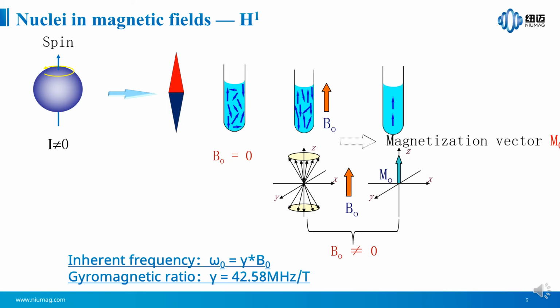The magnetic resonance device, the EDU-MR we mentioned earlier for this course, has a field strength of a half Tesla. According to this Larmor formula, the resonance frequency of this device is about 21 megahertz.